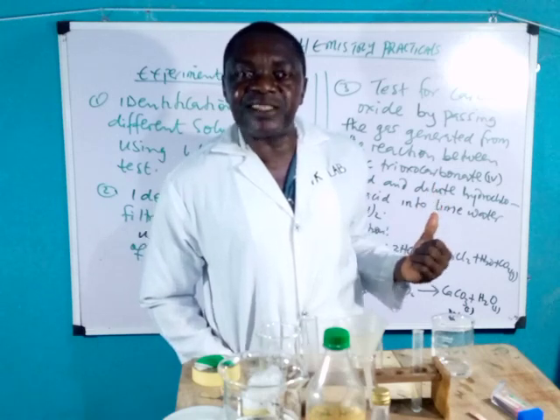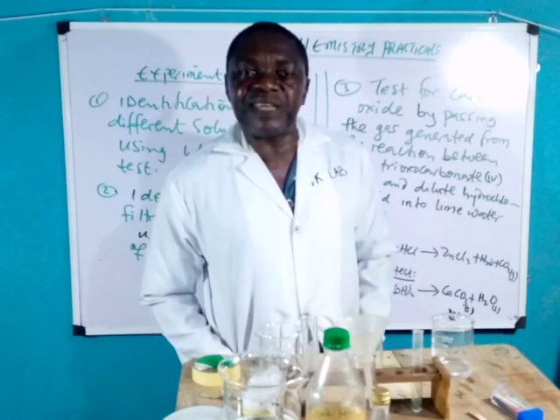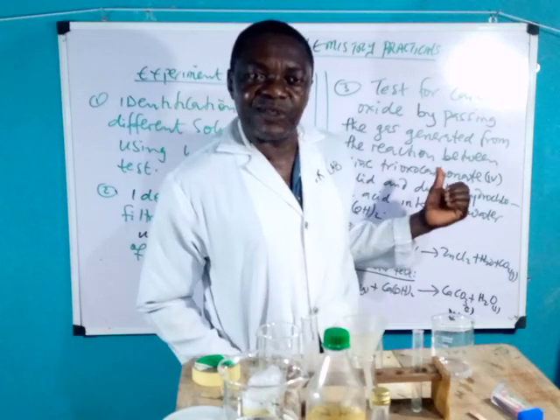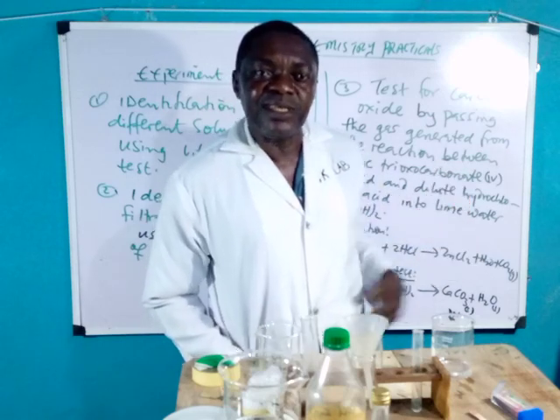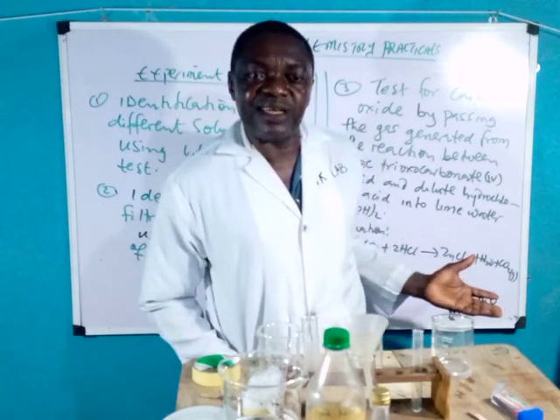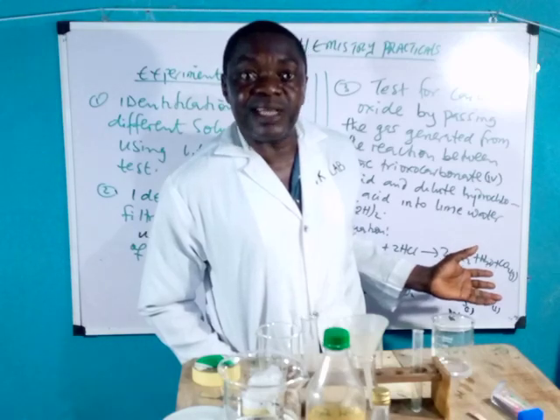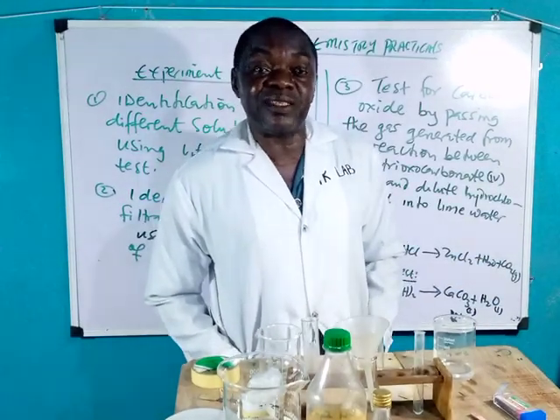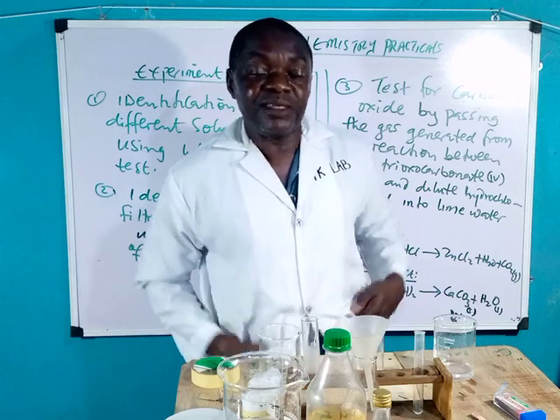It is believed that when you see vigorous effervescence, you should know that carbon dioxide is liberated, and you have to write for them the results you are going to get today. That is why I deem it fit that we carry out most of these tests before I go into salt analysis, because in subsequent classes we are going to face salt analysis proper. So let's get started.